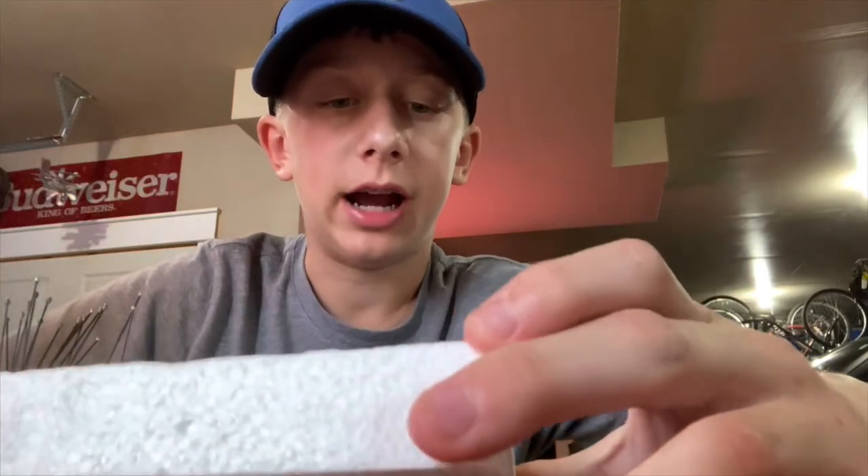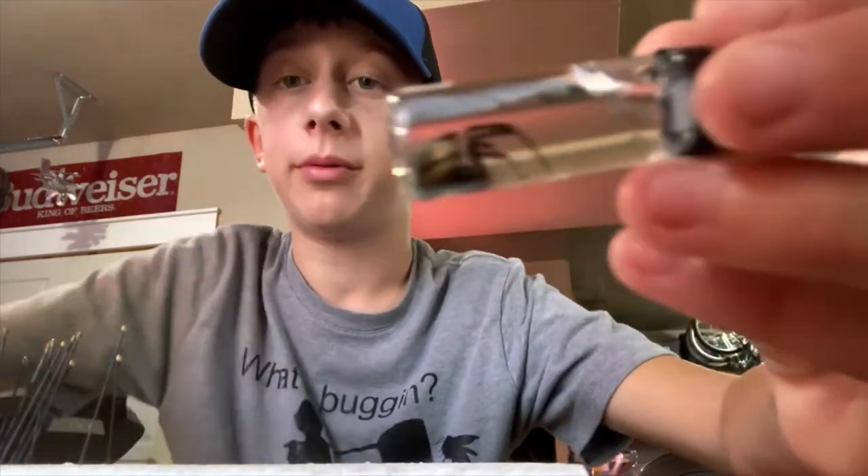Today I'm going to be showing you how to create alcohol specimens. Alcohol specimens are insects or arachnids — bugs in alcohol — like this black widow.